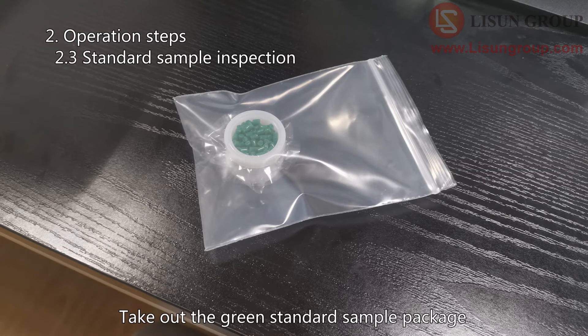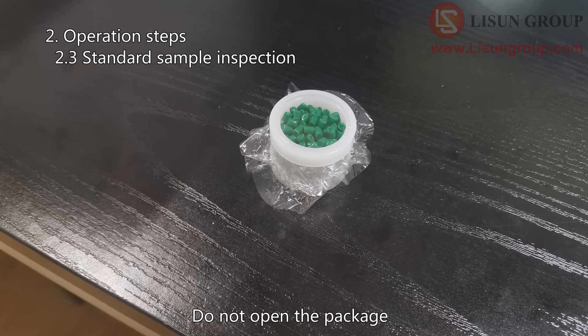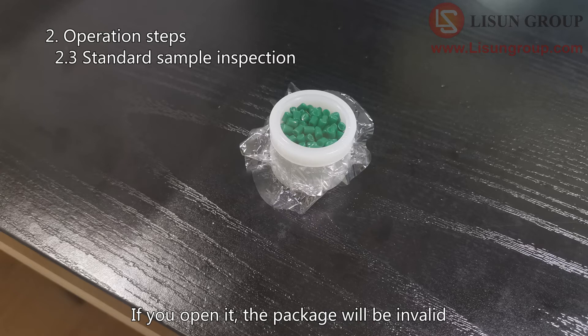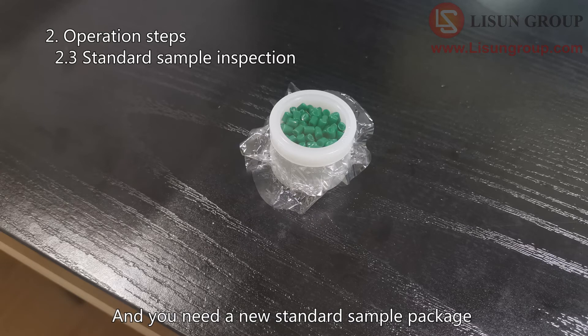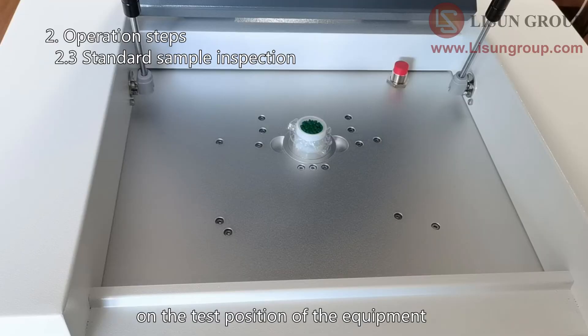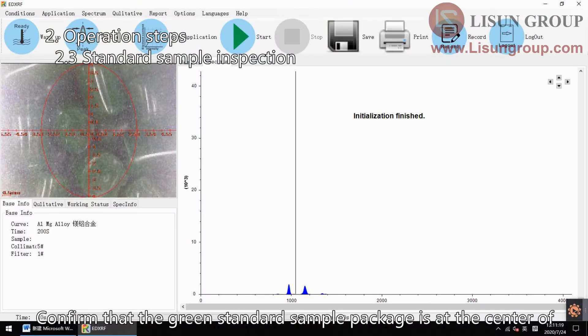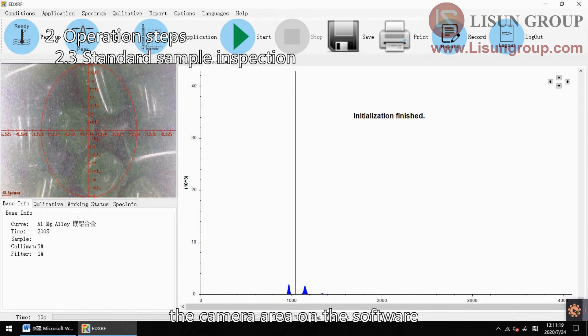Take out the green standard sample package. Please note: you only need to take out the package from the valve bag — do not open the package. If you open it, the package will be invalid and you will need a new standard sample package. As shown in the figure, put the standard sample package on the test position of the equipment and close the cover. Confirm that the green standard sample package is at the center of the camera area on the software.